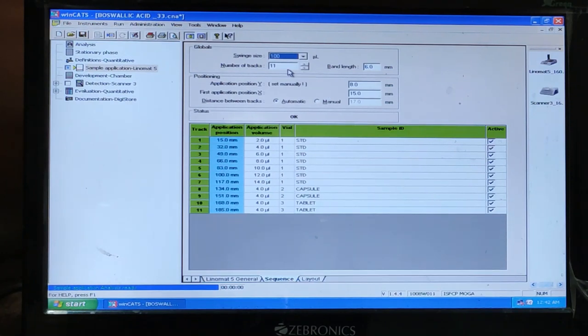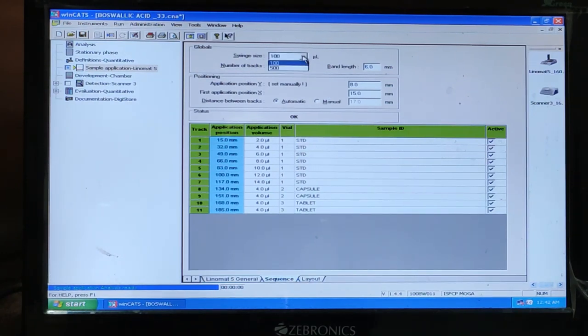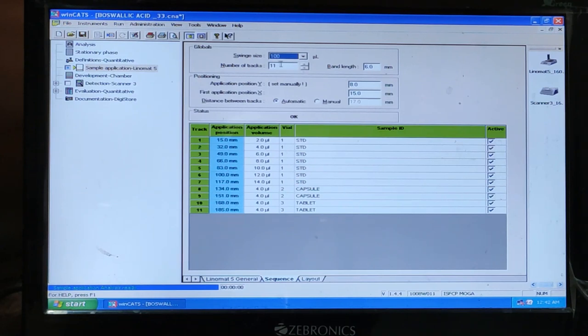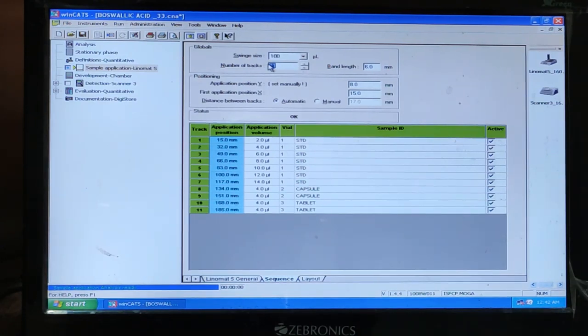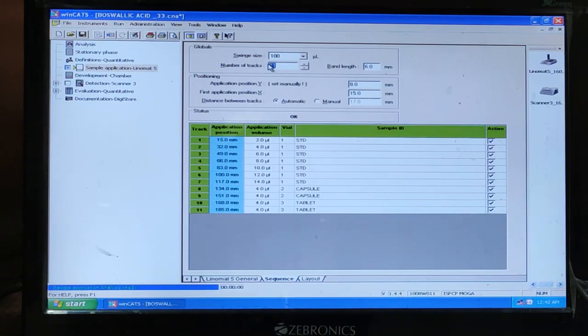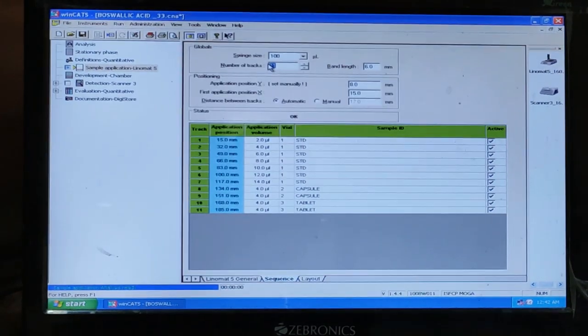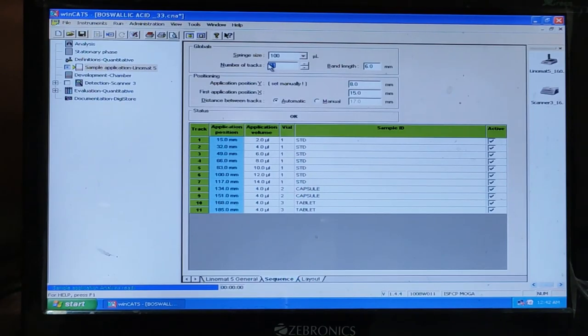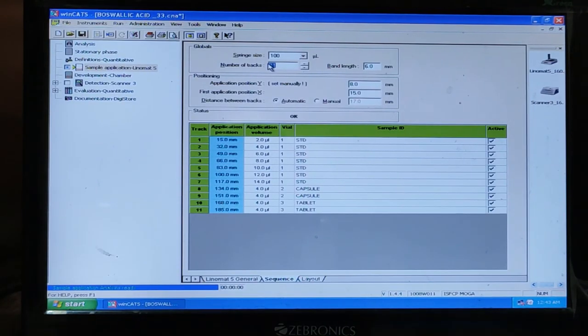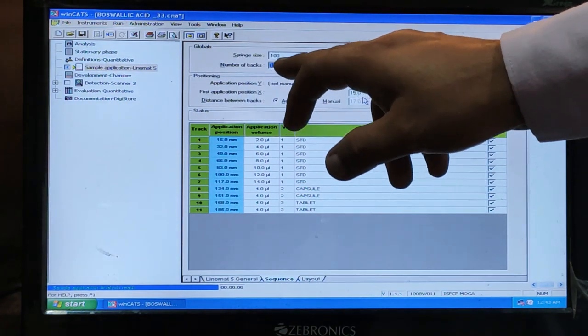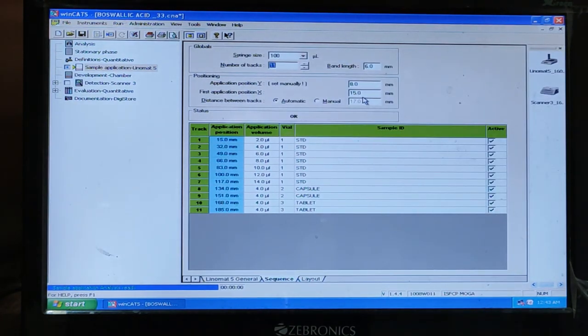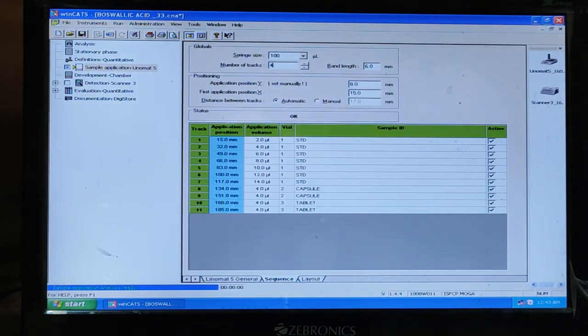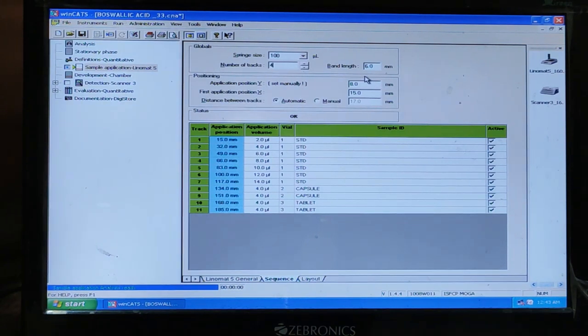This is another important thing. So here size of the syringe. Then number of tracks. This is very important because sometimes scholars get confused. What is the meaning of the number of tracks. You can change as per your requirement. Here number of tracks, I have written 11. So if I am going to change to 4.